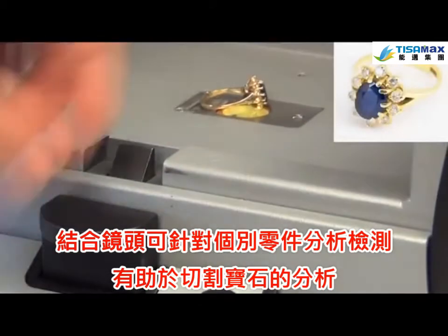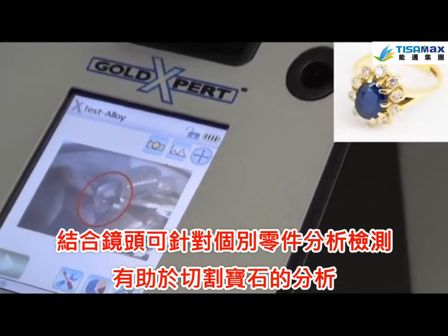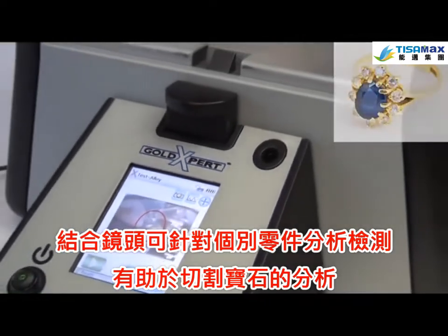An integrated camera allows the Gold Expert to focus on and get results from individual components. This is useful when testing pieces that include gemstones.